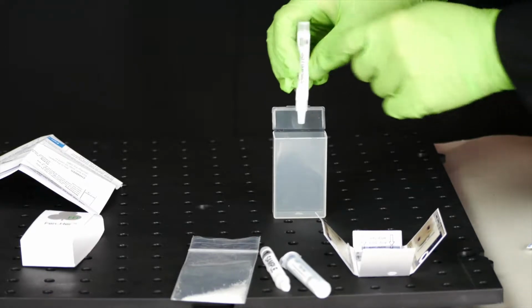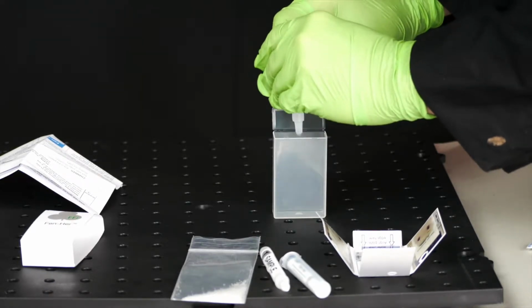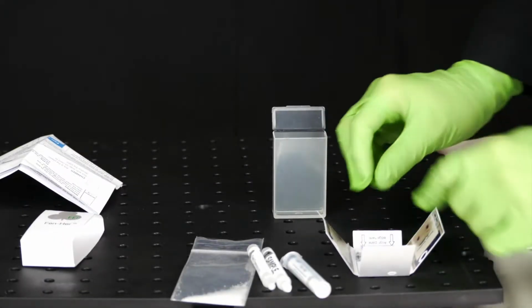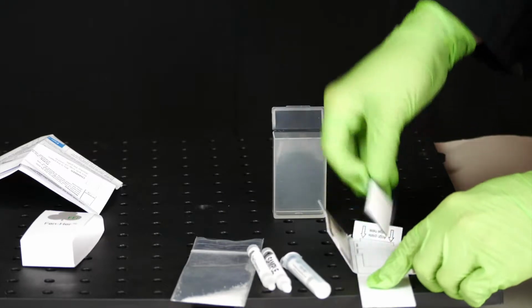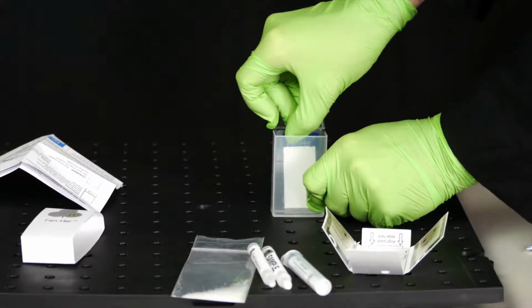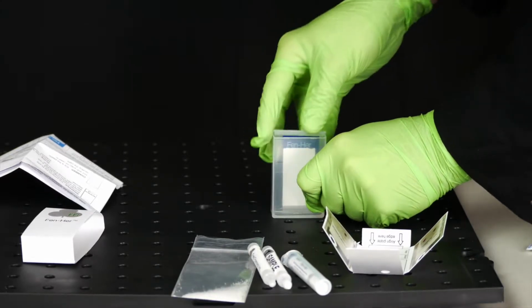Break dropper tube ampule into the chamber as seen here. Keep the chamber level during testing. Pick up the plate by the backing and insert the plate into the chamber along the back wall. Close the chamber lid to lock the plate in place while keeping the chamber level.